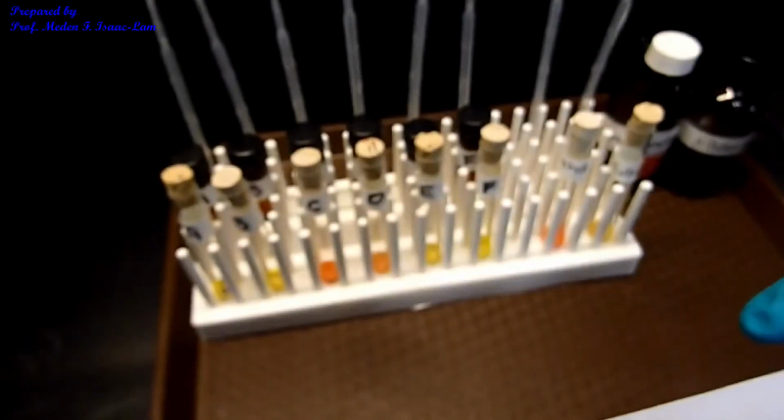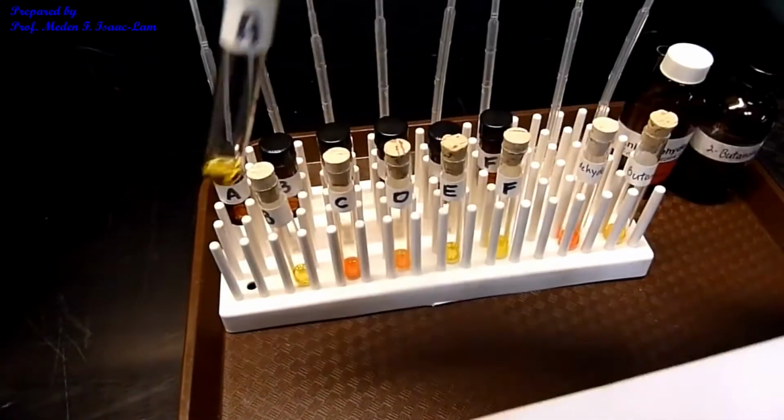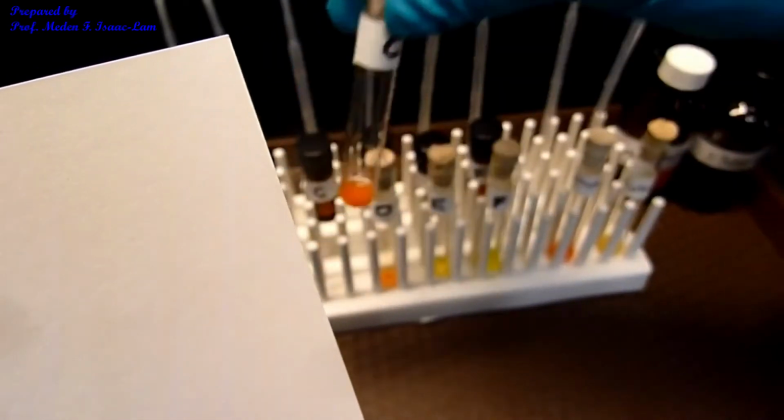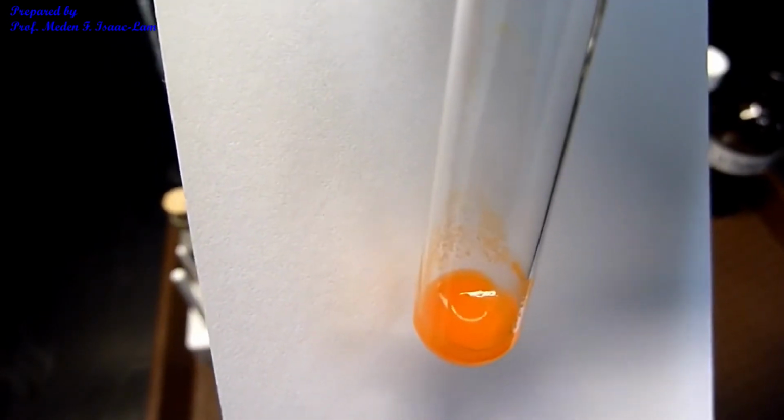So now for the unknowns A, B, C, D, E, and F. A is completely clear, no precipitation. And then B, again the same, no precipitation at the bottom, it's clear, yellow. The reagent is colored yellow, but if there's a reaction, there's a precipitate. Unknown C has a precipitate which is orange, like the color of pumpkin.